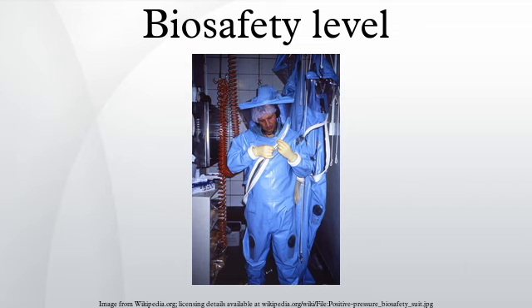Biosafety Level 4. This level is required for work with dangerous and exotic agents that pose a high individual risk of aerosol-transmitted laboratory infections, agents which cause severe to fatal disease in humans for which vaccines or other treatments are not available, such as Bolivian and Argentine hemorrhagic fevers, Marburg virus, Ebola virus, Lassa virus, Crimean-Congo hemorrhagic fever, and various other hemorrhagic diseases. This level is also used for work with agents such as smallpox that are considered dangerous enough to require the additional safety measures, regardless of vaccination availability.